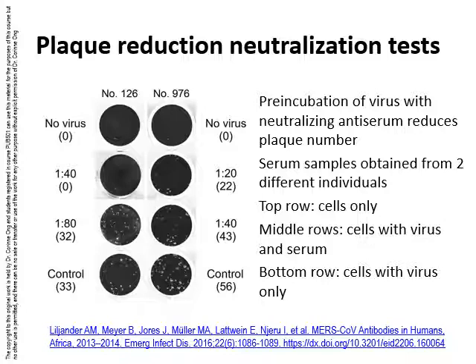The wells on the very bottom row are also controls. These are actually negative controls, as virus samples which had the same concentration as the test wells were added to the wells without any serum. You can see many plaques present in both these negative control wells, and the numbers provide the baseline level to score the extent of antibody neutralization.